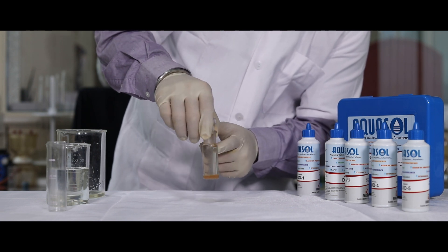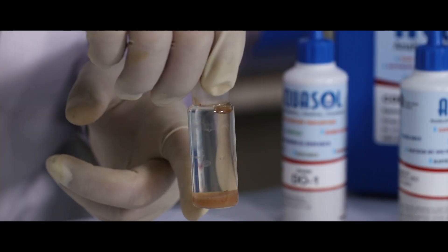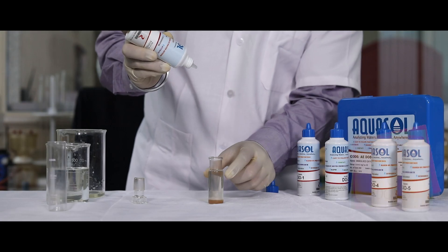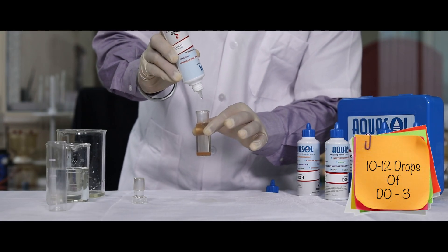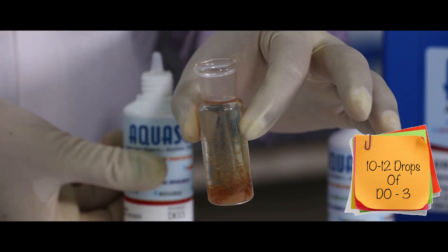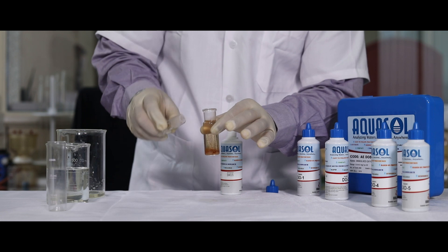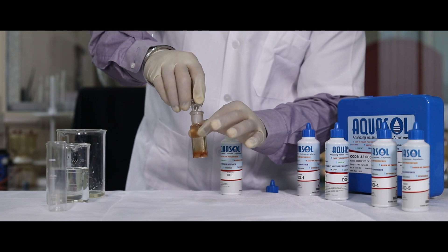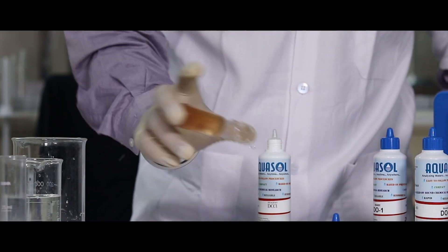After the desired time, there will be a precipitate at the bottom. Now add 10 to 12 drops of DO3 reagent. Place the stopper and mix till the precipitate dissolves.